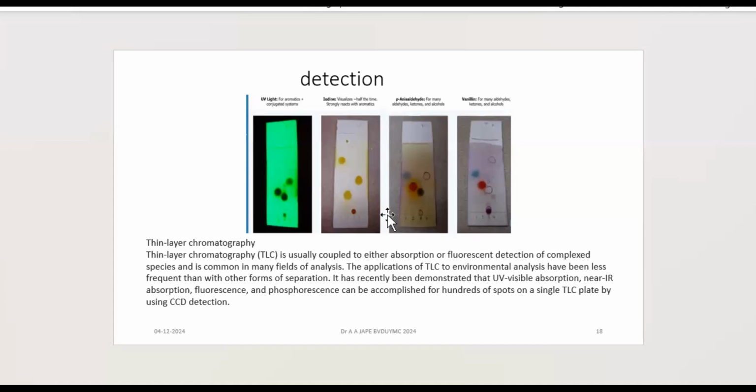Another thing that you can use this data to find out is the amount of the analyte at a given spot. The amount of the compound present in a given spot can be determined in different ways. Maybe on-plate quantification, where radio chromatograph scanning is done out of different development methods. If we are using radio labeled compounds and radio scanning, it will be very easy.